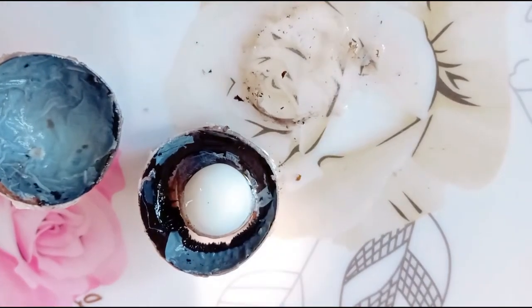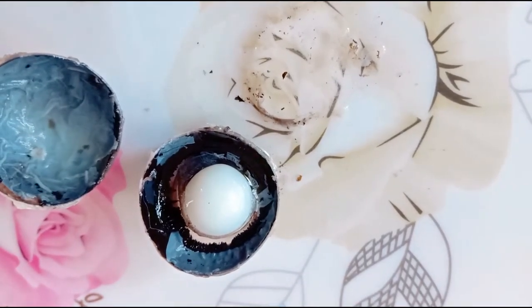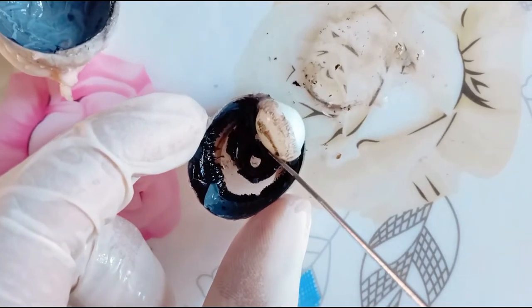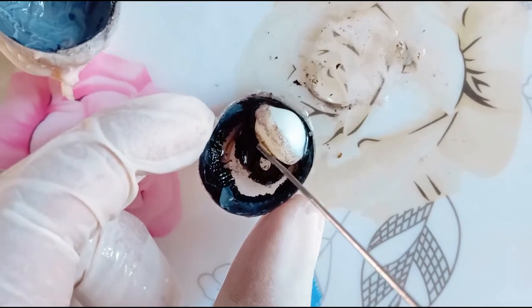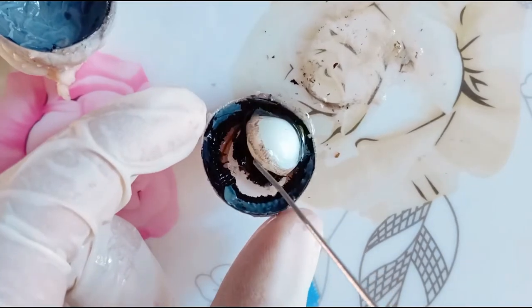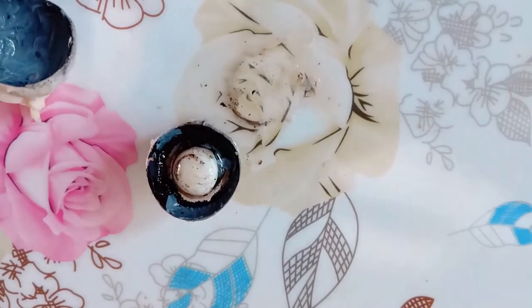These liquids help the eye to retain its shape. Since both humors are transparent, light easily passes through them. The eye lens is held in position by the ciliary muscles and suspensory ligament, which are connected to the choroid. The ciliary muscles alter the focal length of the eye lens. Now let's detach the eye lens.